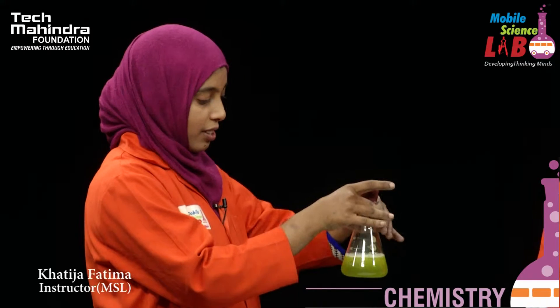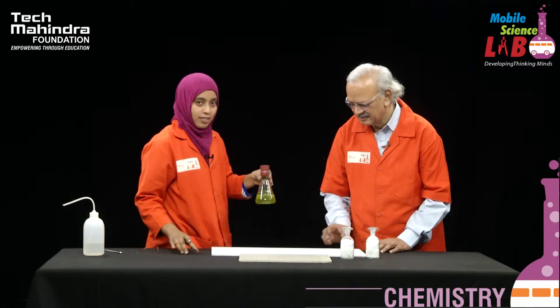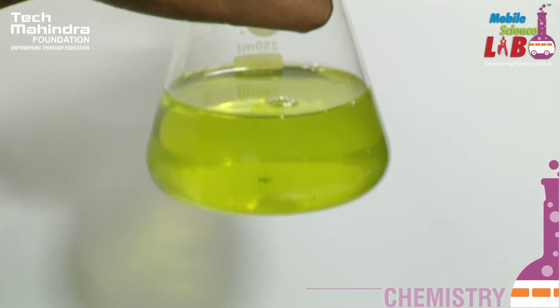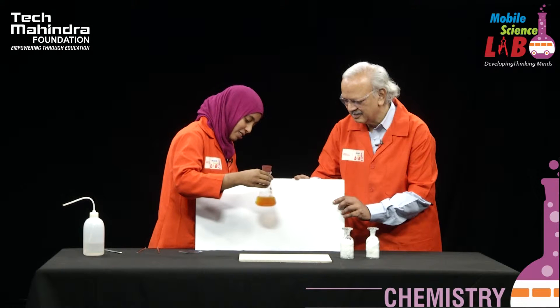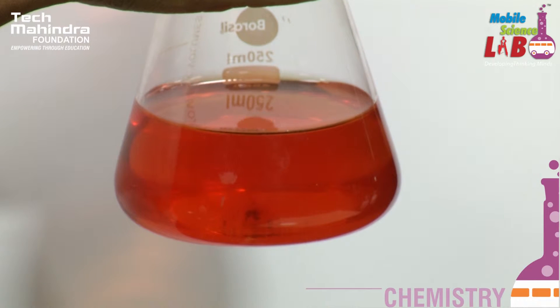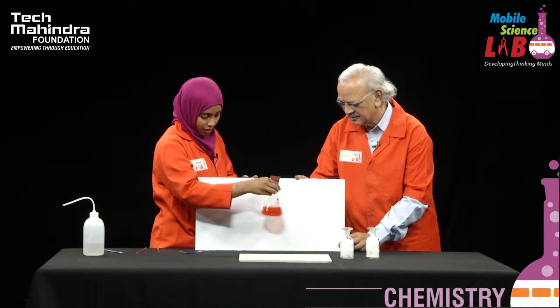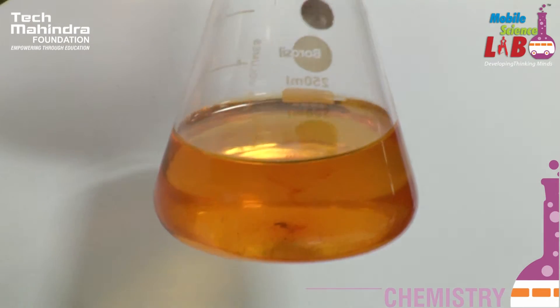Green! The moment I shake, we got a green colour. I will try to show the students with a white background over here. Wow, so beautiful green colour sir. The colour changes towards red now. Red. After red, last but not the least, yellow colour.